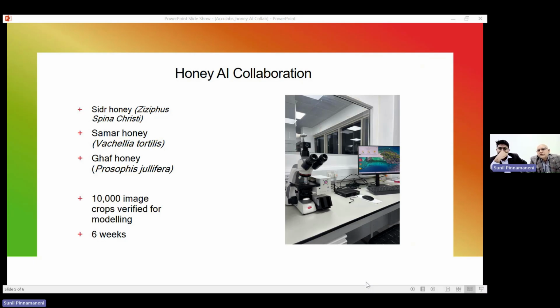With experience, we initially followed their sample procedure as explained by Asma. And we came to know that we have to adapt ourselves to our samples and improve the quality and the imaging. So I went back to the processing of how the honey was extracted from the field and got into the lab.